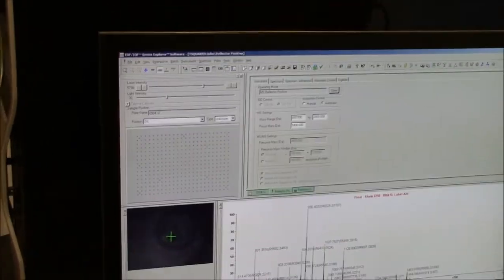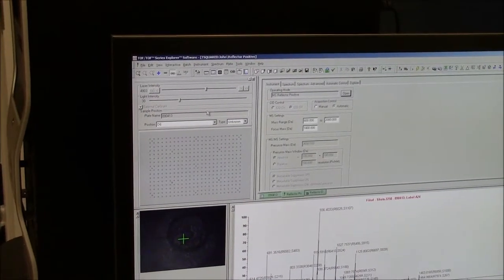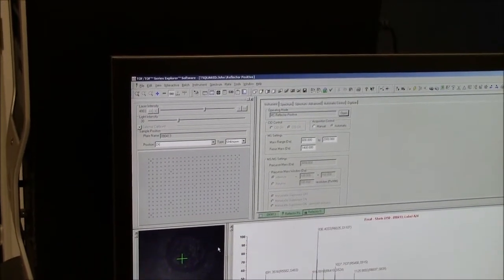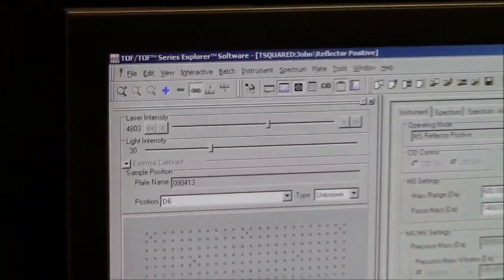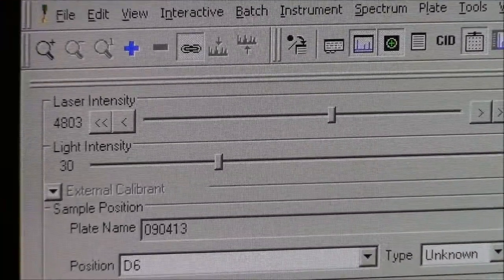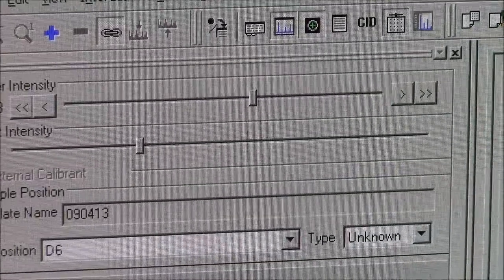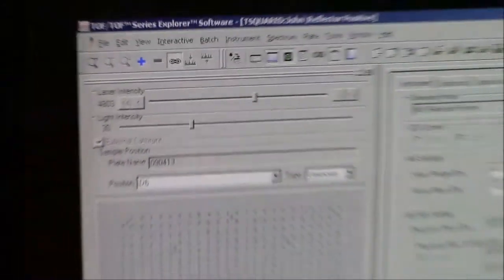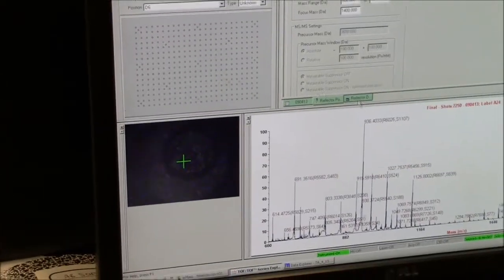This is what changes the laser power here. I recommend for DHB, a starting laser power in reflectron mode, start around 4,800 laser power, 4,900 laser power. You can always work your way up. I've seen people go up to about 6,000. That's approaching too much laser power. If you physically see the laser moving a crystal or ablating a crystal completely, you're using way too much laser power. There's always too much laser power and there's too little. I'll show you both.